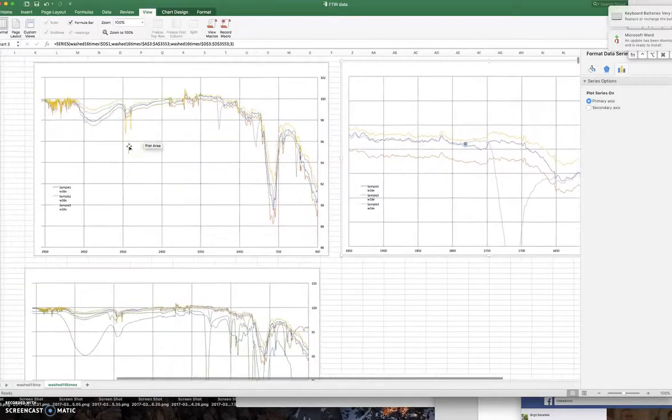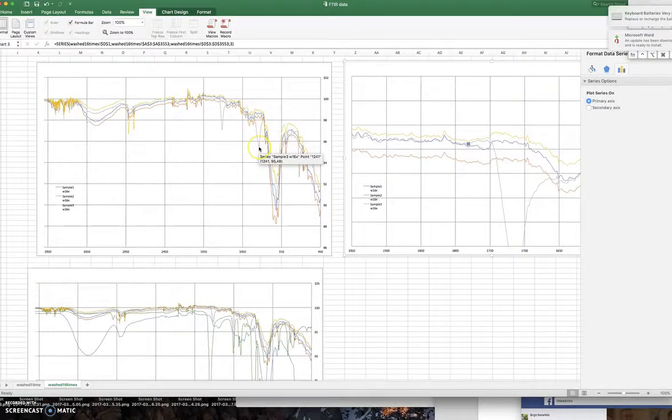By the way, I right now see here that there's a contribution here as well in sample 3, which is completely not seen anywhere else. So I don't know what this one around 1238 may be. So that is interesting. There's also something around here, 725. I don't know what that is either. And here maybe is something as well that is different.